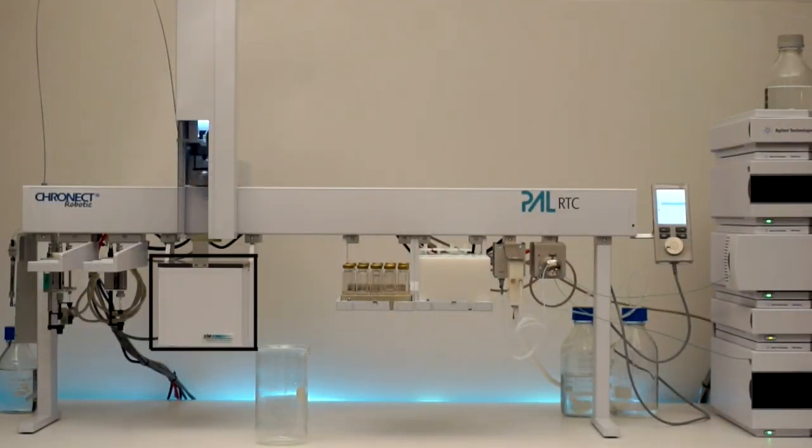Furthermore, the system includes an ultrasonic bath, a sample rack, a block for syringes as well as for syringes with membrane filter, a wash station, and a sample injection valve for LC.